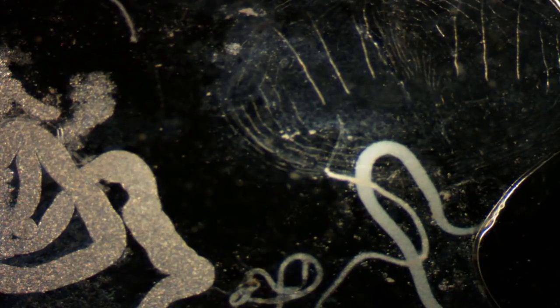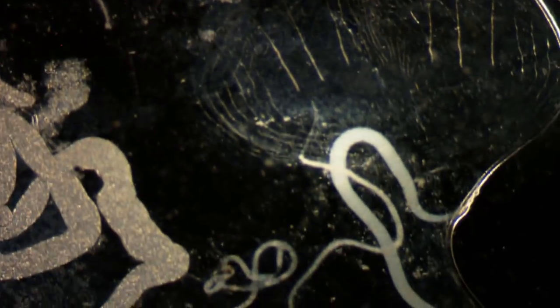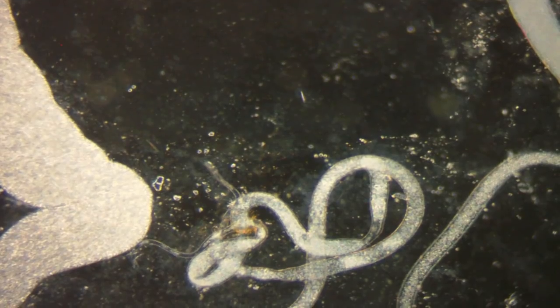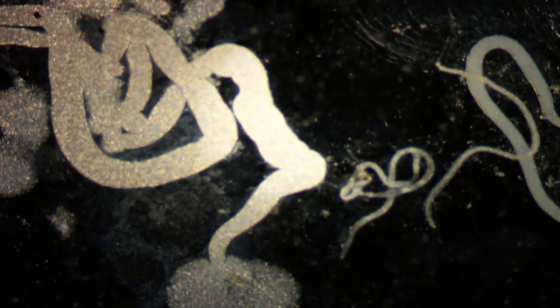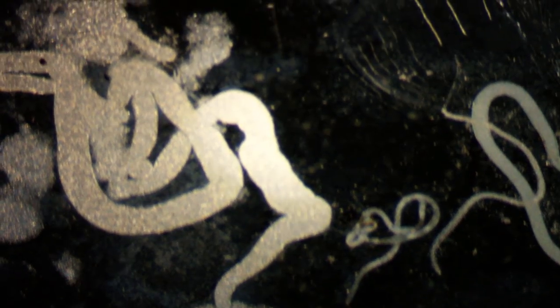This looks like a fully grown adult worm. And then there's these smaller ones that are like the babies, so to speak. These are really crazy. You would think that Levamisole would handle this. It seems like they have a round head, and then they have a tapered off body, and it comes to an end. That's the end that just tapers off to a little tiny tail. This is really crazy stuff. It looks like some kind of nematode, some kind of parasitic nematode, some kind of pinworm, something crazy like that. I've never seen anything like this on any fish that I've ever kept. I'd really like to figure out what it is.